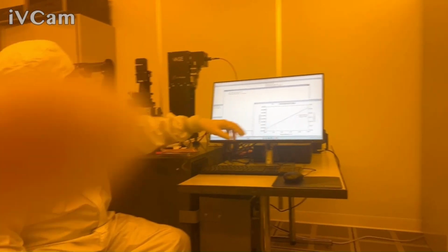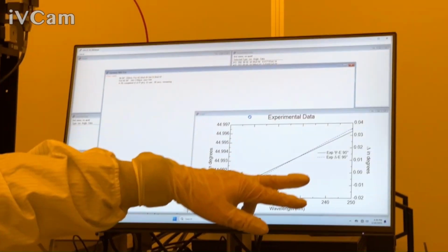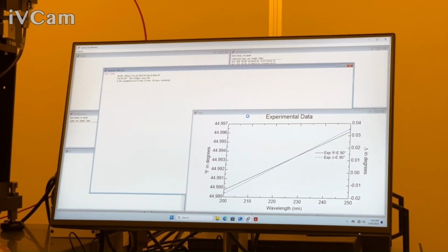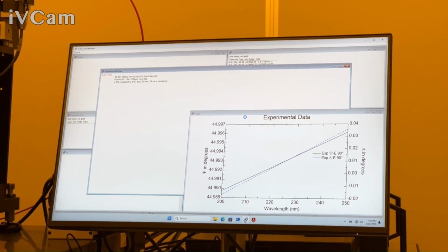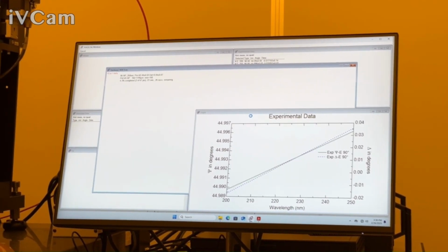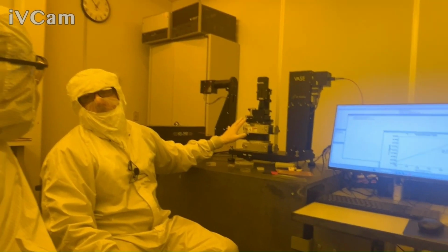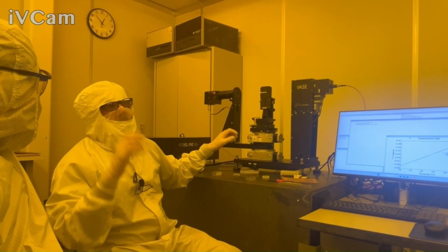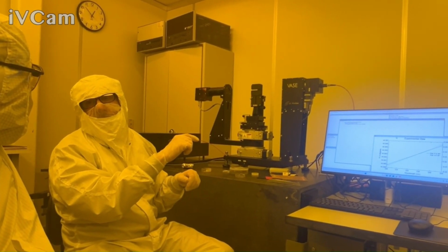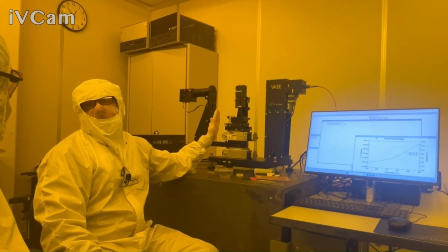So again, for this measurement, psi should be 45, delta should be 0, across the spectrum. What angles are we doing? Currently, there are 2 ways I could do this. I'm doing air, so I could either say 90 degrees or 0 degrees. If I say 0 degrees, I'd have to click the other button that says transmission measurement. In that case, it would move this to 0. That's what you do for a standard transmission scan.